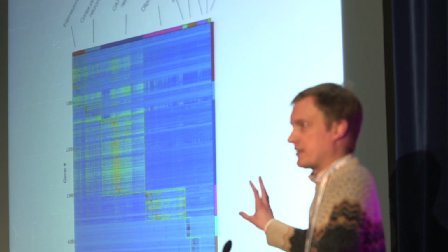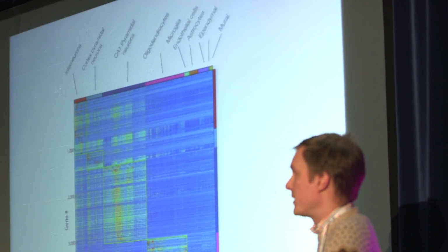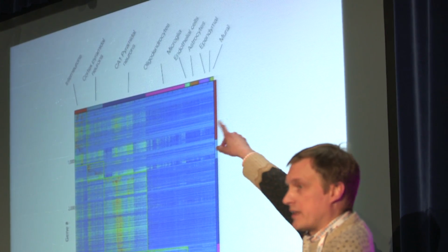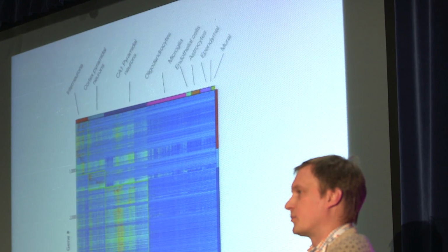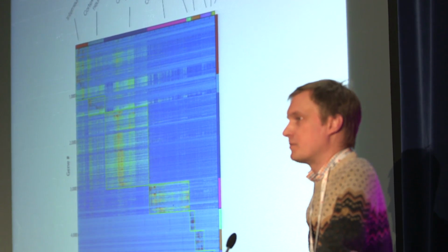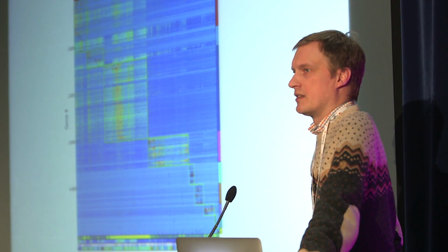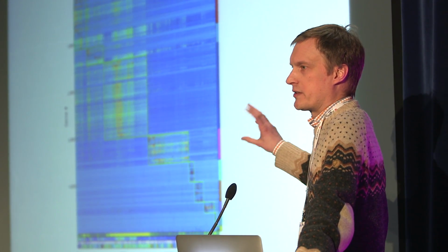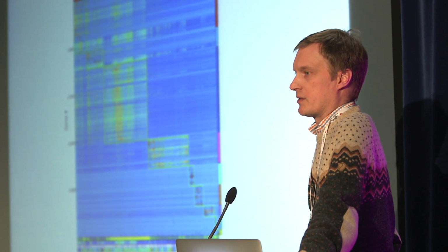And then we sorted the matrix, and this reveals these block-like structures that correspond to major cell types. They're also indicated up there. So this shows one thing that was quite surprising to us when we first saw this, that at least major cell types are characterized more or less by their own sets of genes. So you get these blocks. There are no combinatorial structures on the high level. It's really these very cell type specific blocks.